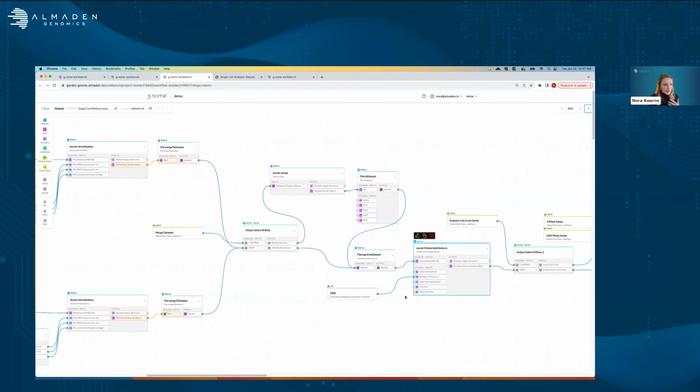So you have the ability to go in, and I've just done this here. Normally the Seurat find variable features algorithm returns the top 2,000 most variably expressed genes in each sample. Here I've just changed it to 1,000. That's just a random example of how you could go in and change individual parameters in your analysis.